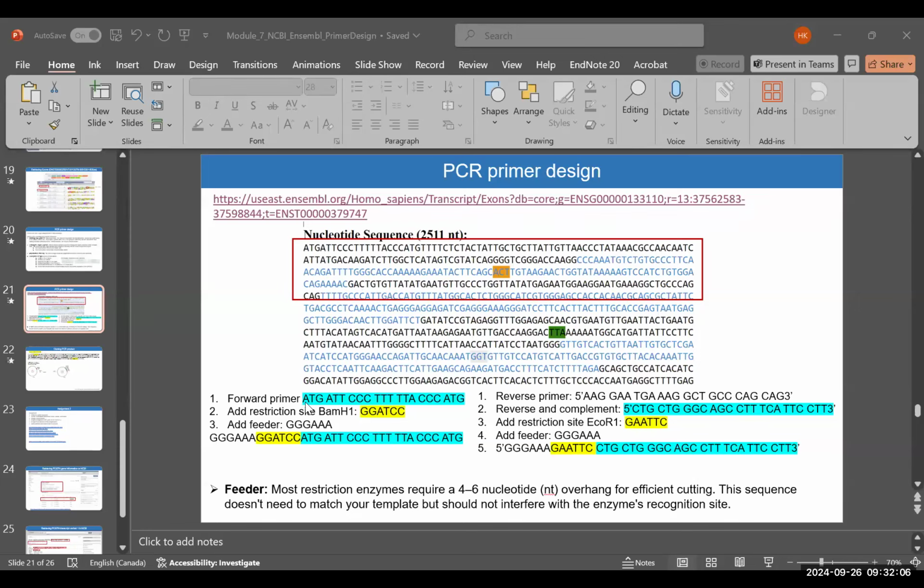We made sure that there were no hairpins, no self-complementarity, and no annealing on itself. We know the GC content and the melting temperature. For example, in the assignment, if I ask you to do a primer and you see that the salt-adjusted melting temperature is high, you can say there's no chance that we can change anything in the sequence because we want to amplify this gene.